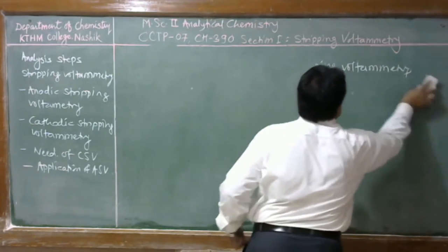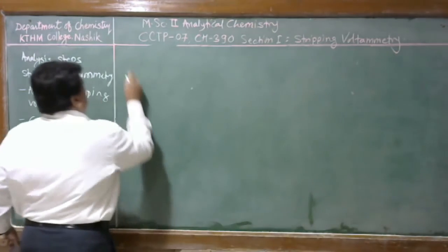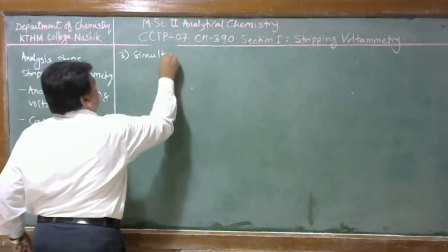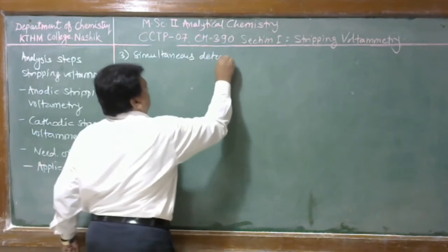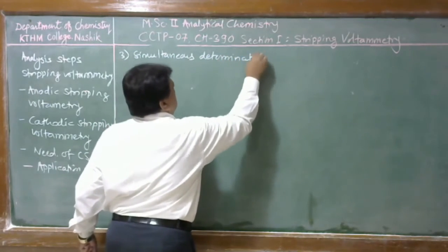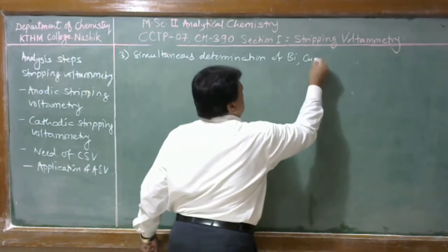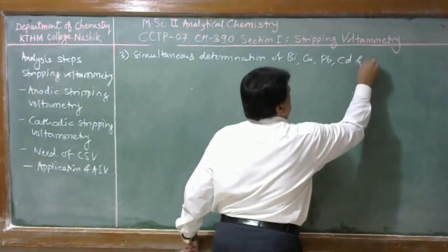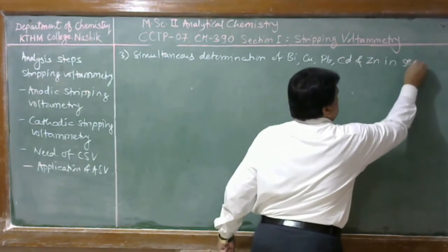for different metal ions present in the mixture. Third application, that is simultaneous determination of bismuth, copper, lead, cadmium and zinc in the seawater.